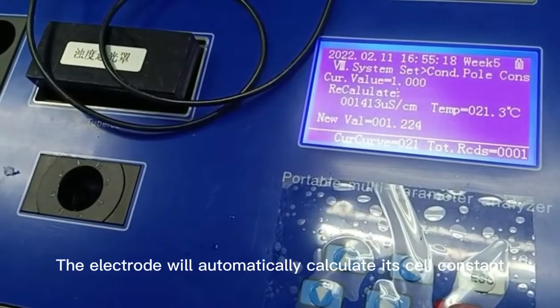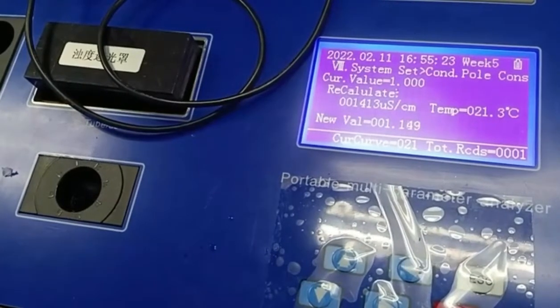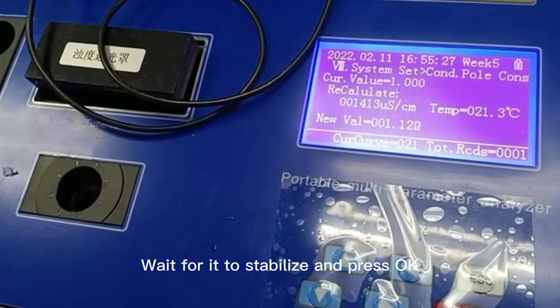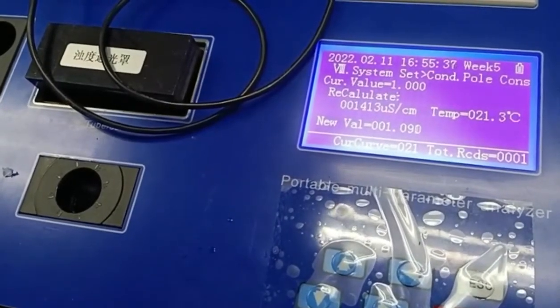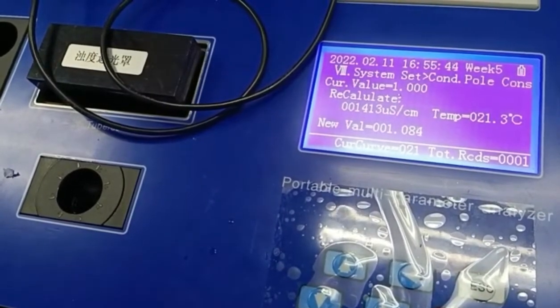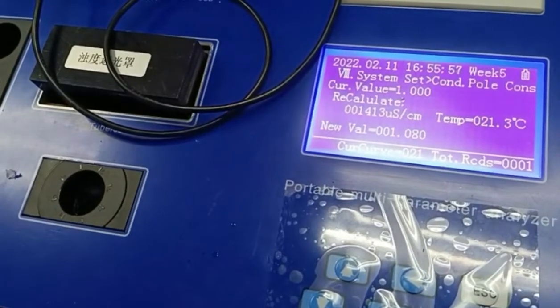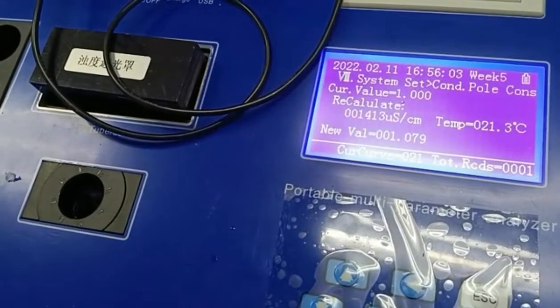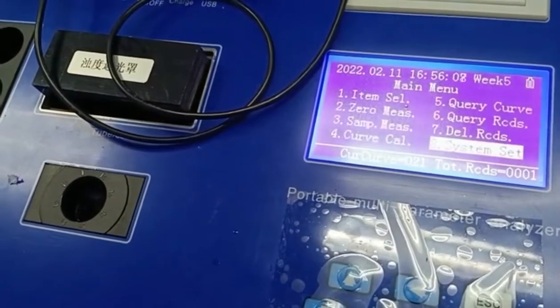The electrode will automatically calculate its cell constant. Wait for it to stabilize and press OK. The cell constant has stabilized and we press OK.